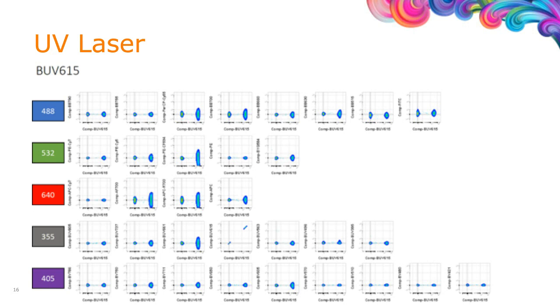Now, we'll go through some of those options in a little while, but when I look at a color like this, I think, let's go to a place where there are fewer receptors on the surface, because this is what it looks like when it's CD4, when there are over 40,000 receptors, not where there are 500 or 1,000. And we're going to look at those experiments in just a few minutes too.